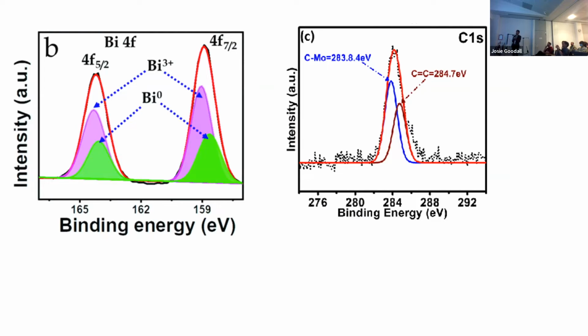And here are some examples of this. Let me try again with the pointer. Yeah, okay. On the left-hand side here we have these different peaks. These are 4f peaks, which are pretty symmetrical, but the authors have decided that there are 2 components in here, and they've decided that the component of lower binding energy makes sense, in this particular ratio. But I can guarantee you could put those in any ratio you wanted, and you will get an equally good fit. So in one sense, it helps your paper. If your annoying referee says, "Well, prove that you have 63% 3+," no problem.